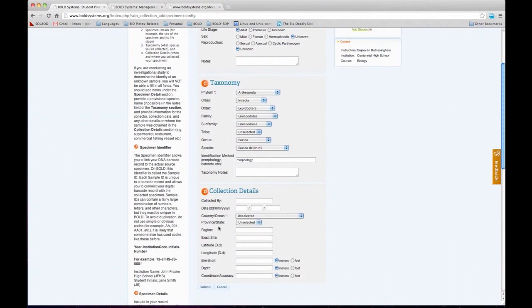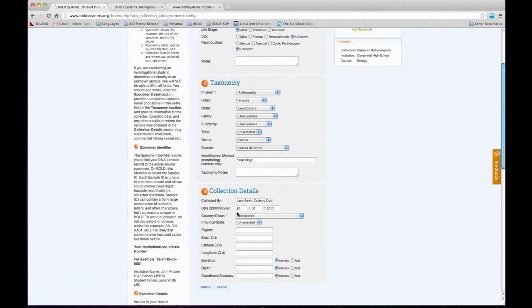Then the collection information — who collected it? In this case it was Jane Smith, and actually one of the students helped collect. It was collected, and the format for the date is day-month-year. Make sure you follow this format, otherwise it can be very confusing. If you switch the day and the month, and the month comes out as 20 or something, the system won't accept it and will throw an error message.